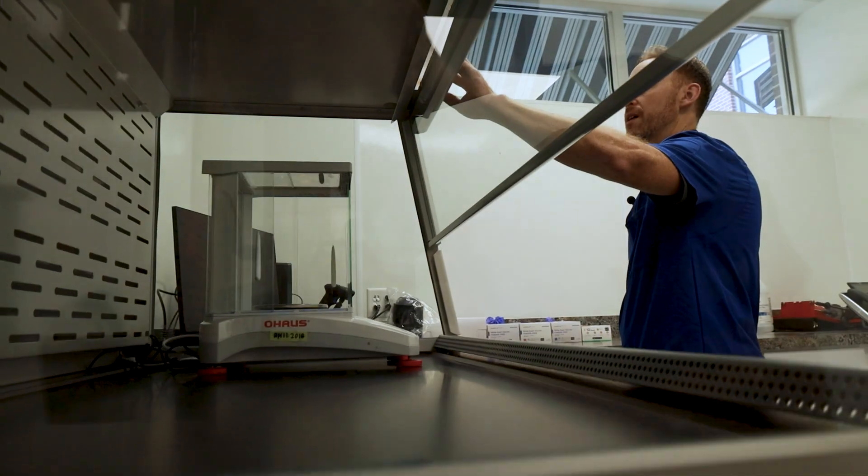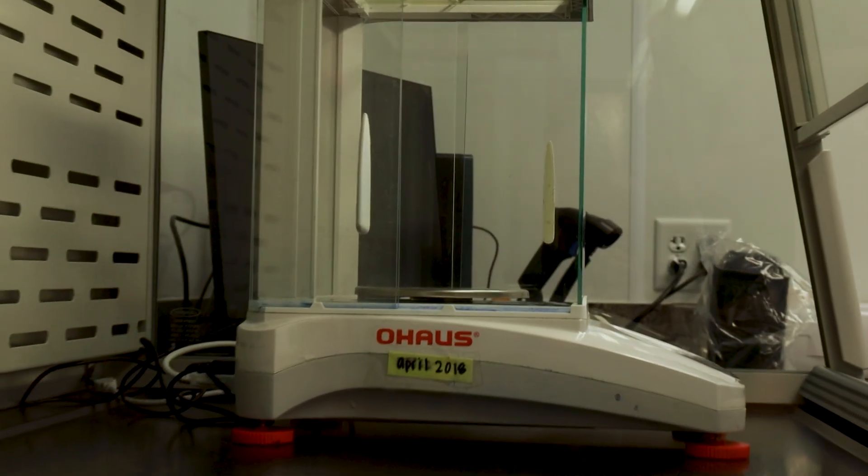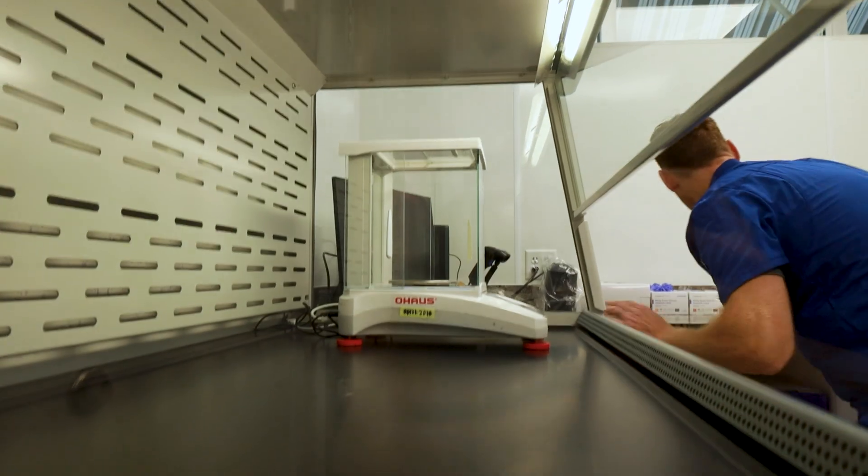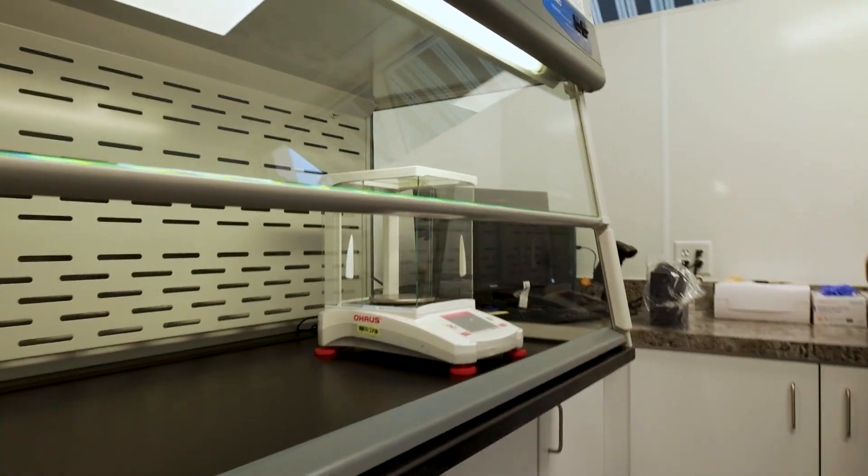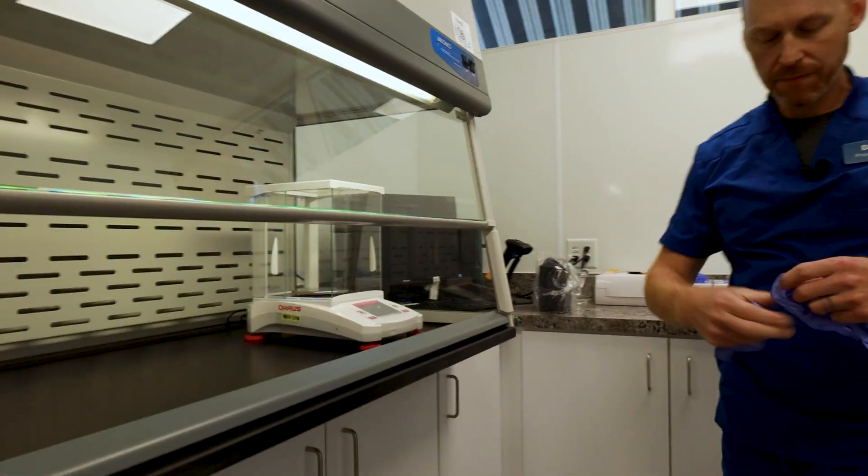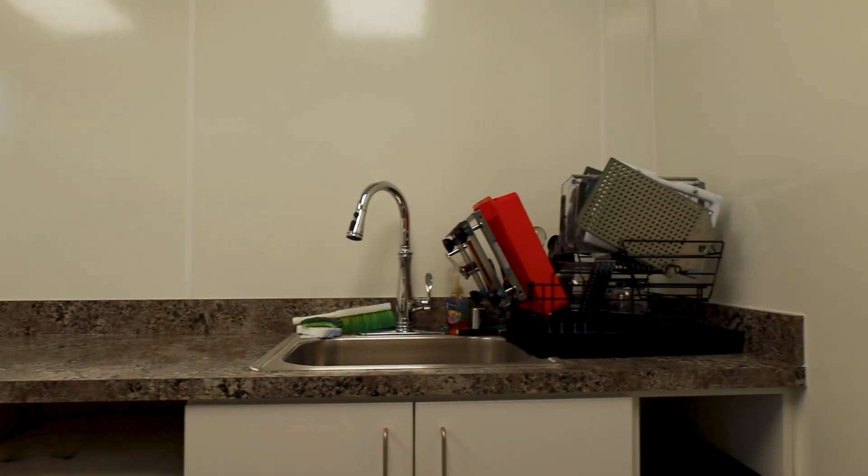So let's turn on this hood. It's going to get a little loud in here. I am going to garb up and we're going to start making some methylene blue. How much time did it take to set up this entire lab? So this lab took about, I would say with all construction, a couple of months. I would say about two months with putting everything together.